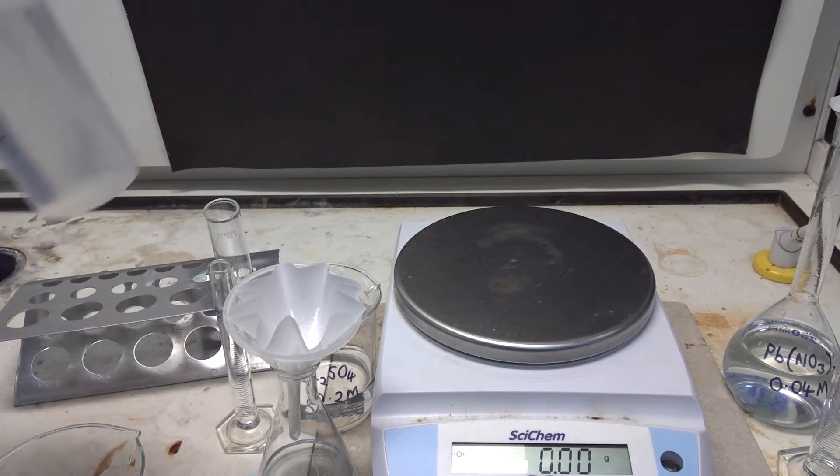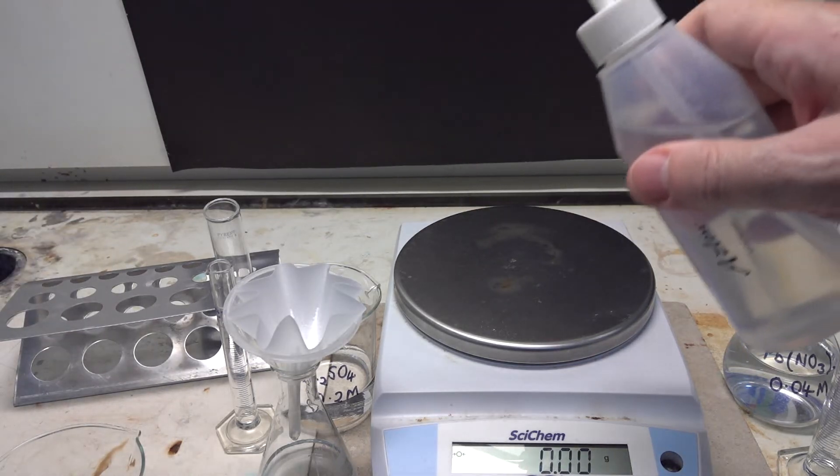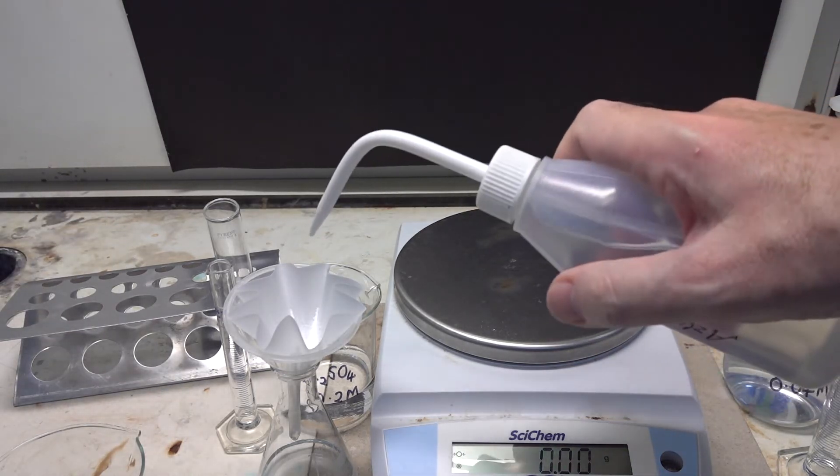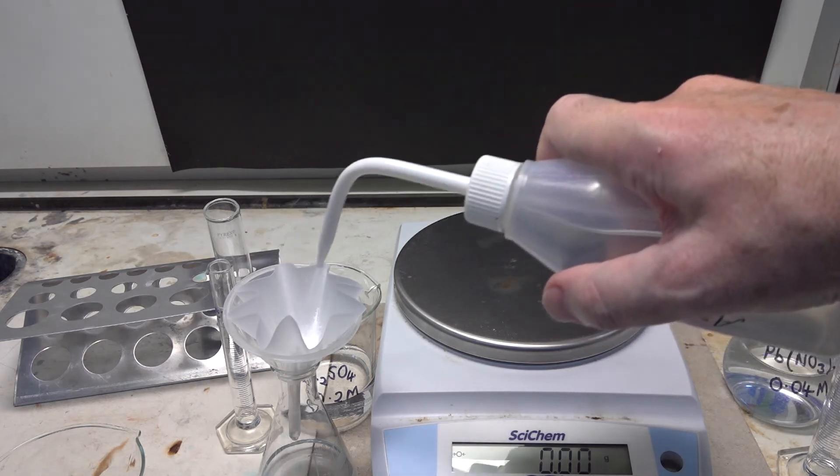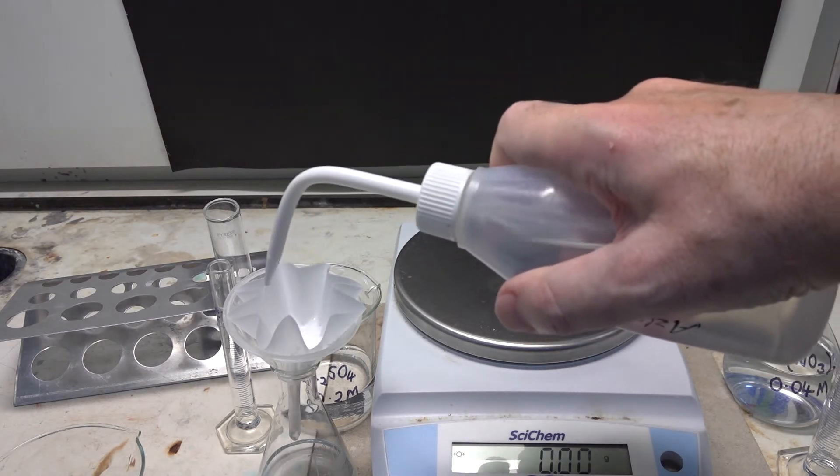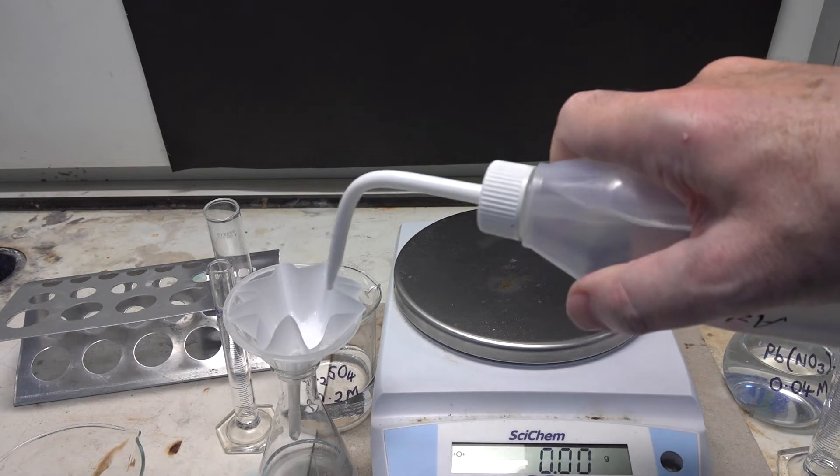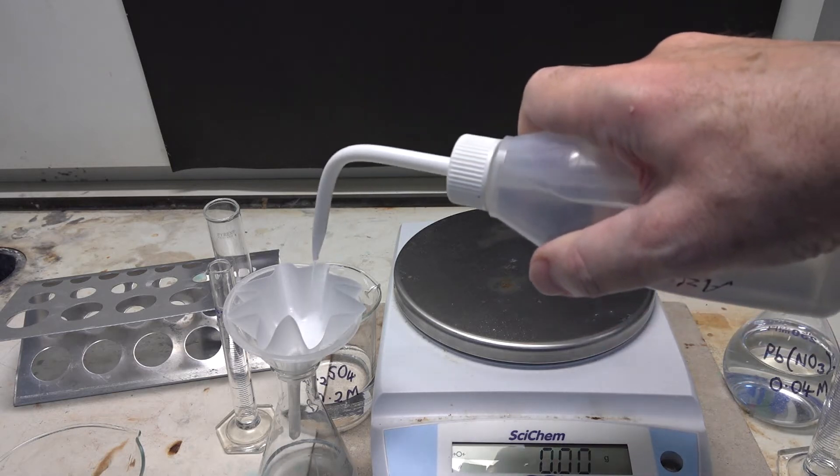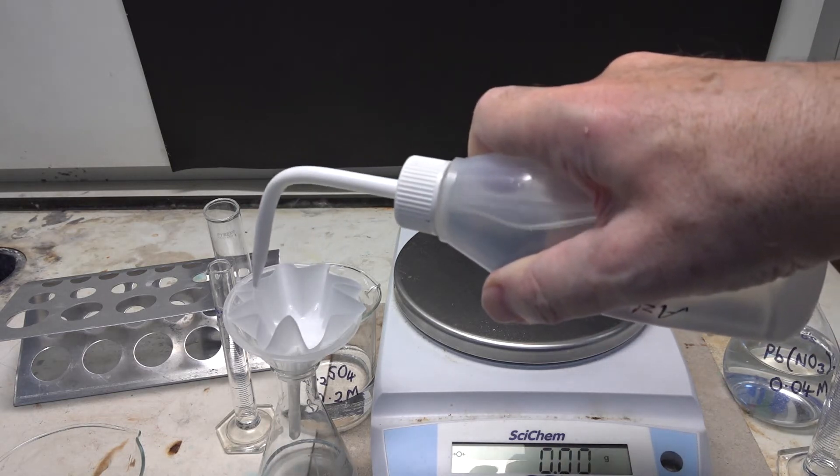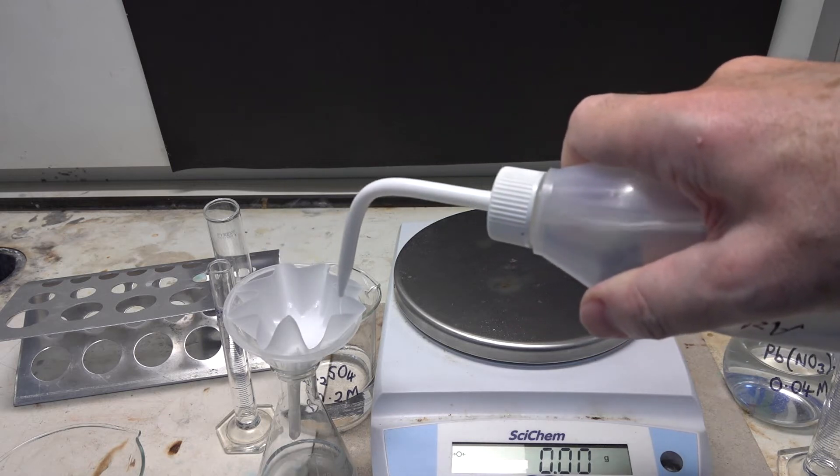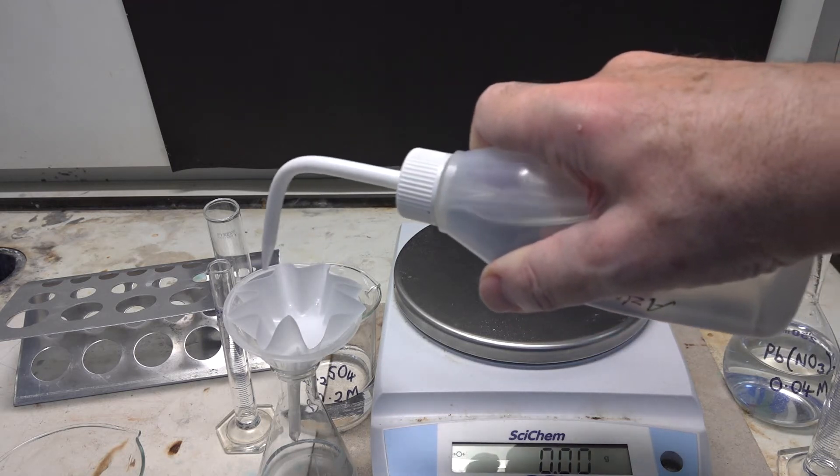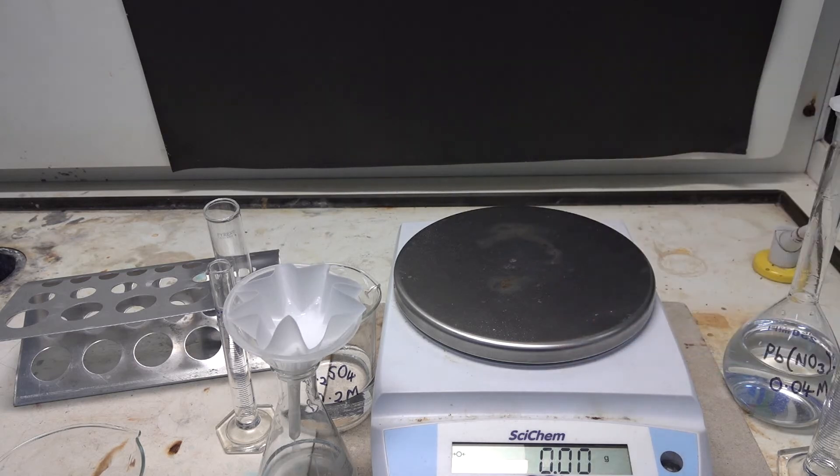Now that we've filtered the precipitate from the reaction mixture, the next stage is to wash the material to remove any impurities. So we do that carefully with the wash bottle, and the distilled water should wash away any soluble impurities contaminating the product.